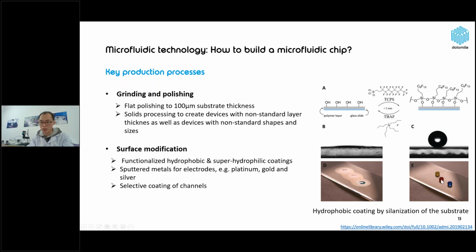It means the water droplet sits on the surface after coating. The left side image is showing the fully wet properties of the surface when we do the reverse reaction, desilanization of the substrate.